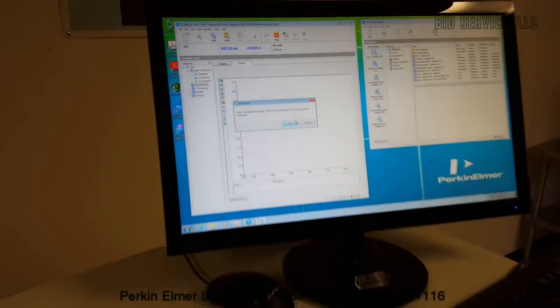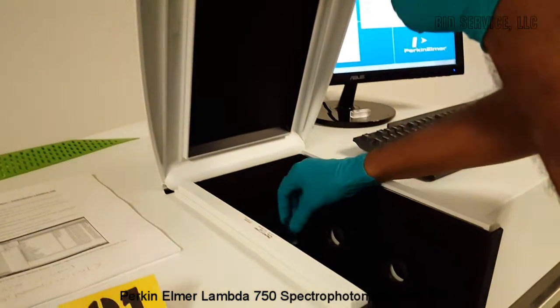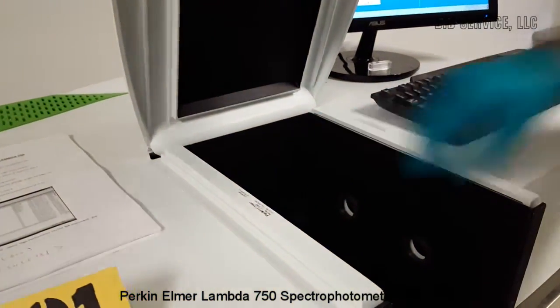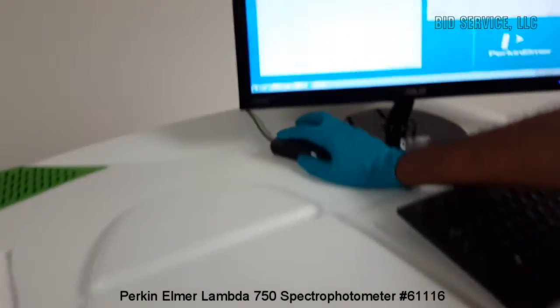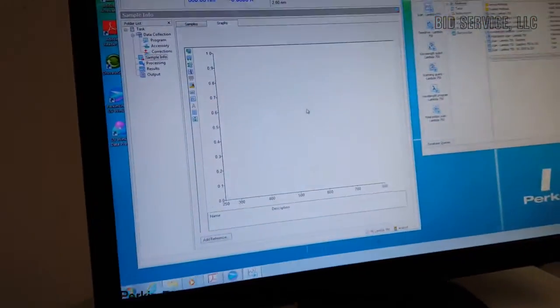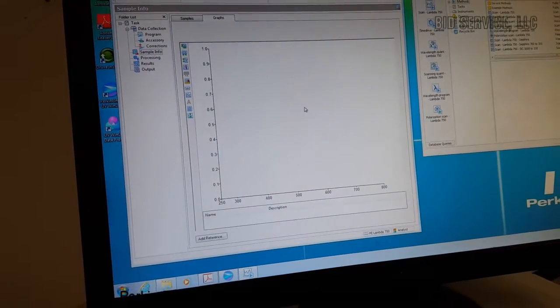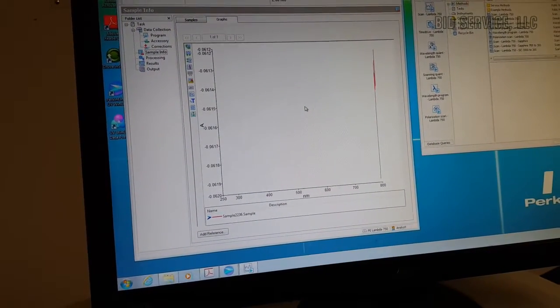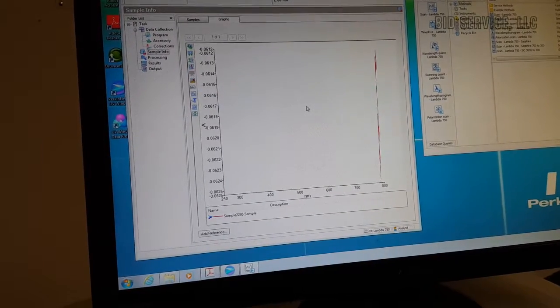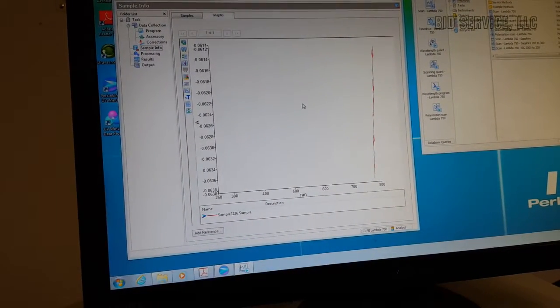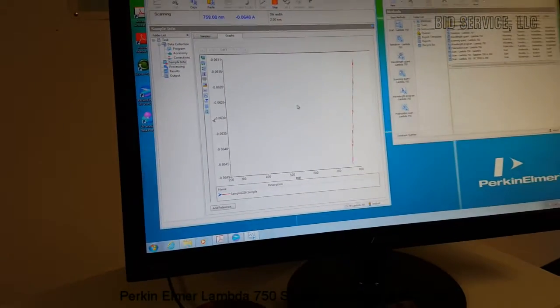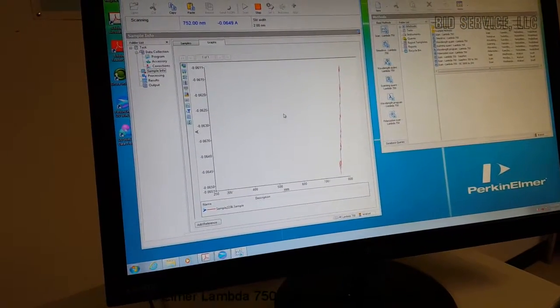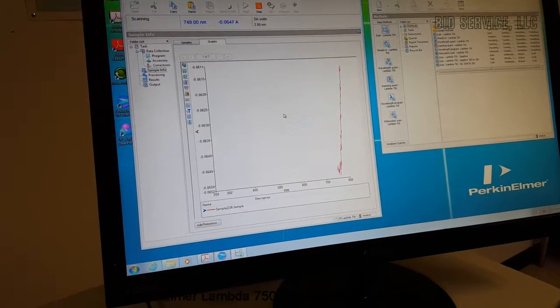So once the 100% transmission collection is over, the scanner will drive to the initial wavelength, that is 800 nanometers, and then the system will prompt to place the sample in the instrument. So I'm placing the sample, and we press OK to start the scan.